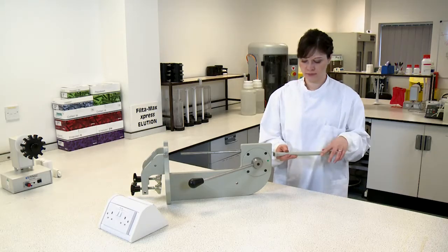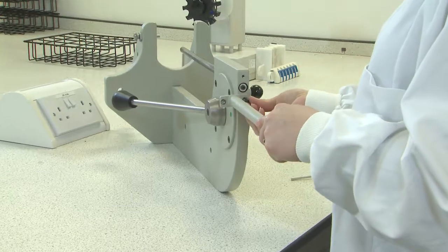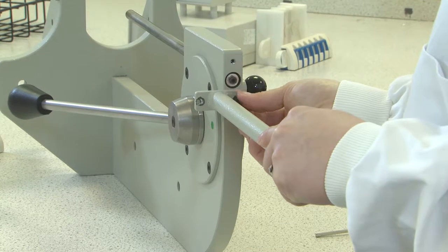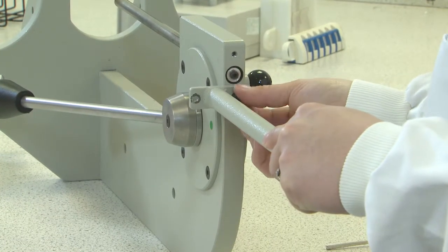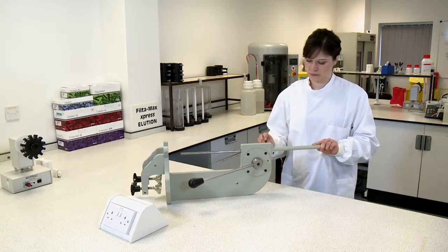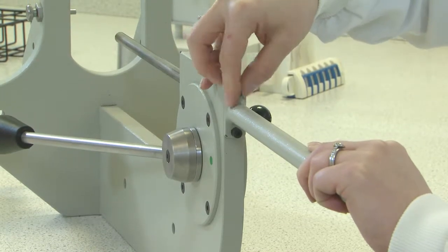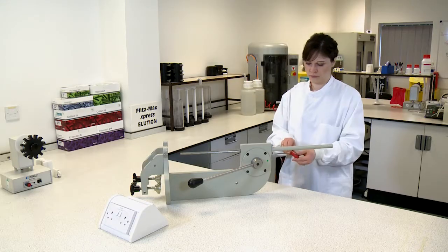The rack guard is supplied separately from the main body of the wash station. To prevent accidental injury, ensure the rack guard is secure prior to operation. To attach the rack guard, lay the wash station on its side and align the two holes present in the rack guard with the holes on the top of the wash station. Insert the two hex head bolts provided and tighten with an Allen key.